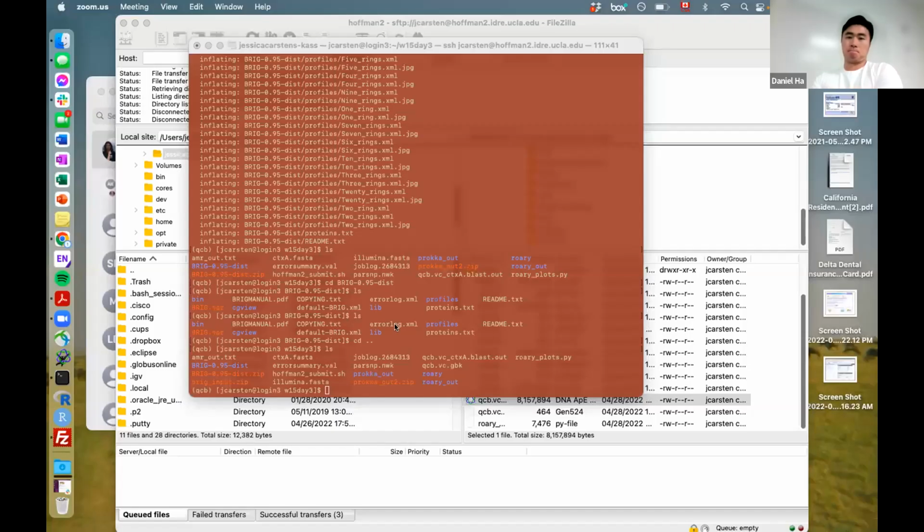Yeah, so can you share your screen? I can help you with the install. Yeah. Should I just share my desktop? Yeah. Okay.